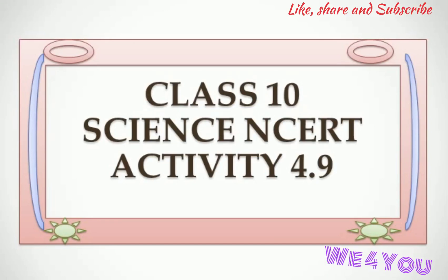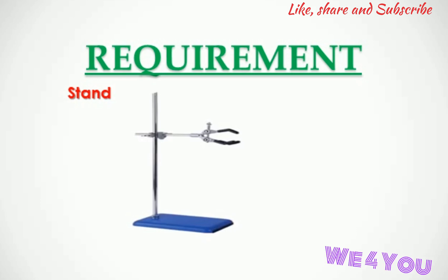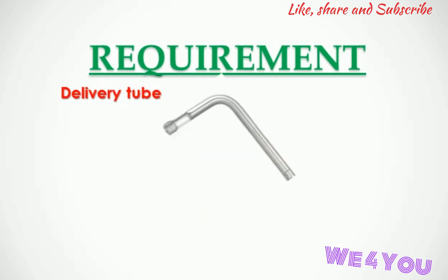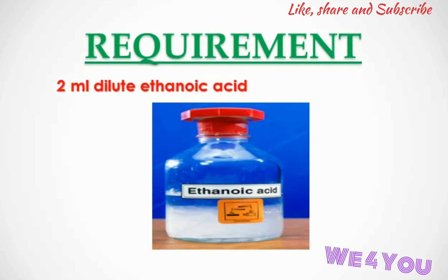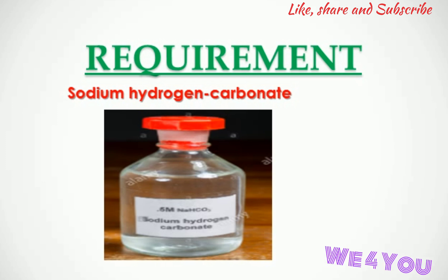Class 10 Science NCERT Activity 4.9. The requirements for this activity are: stand, test tube, cork, delivery tube, spatula, sodium carbonate, dilute ethanoic acid, lime water, and sodium hydrogen carbonate.